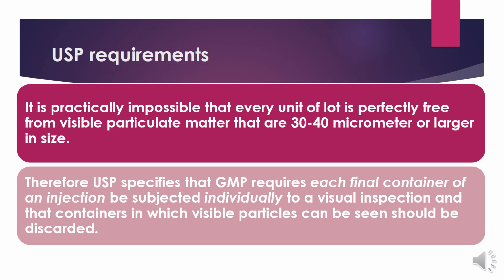Obviously it's impossible that every unit, every vial, every ampule or bottle that is being manufactured for a batch is perfectly free from visible particulate matter, meaning the particles that are visible in nature, that can be seen by the normal human being, and that have the size of 30 to 40 micrometer or larger.